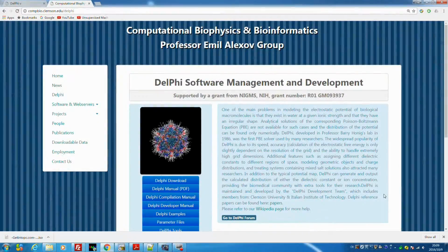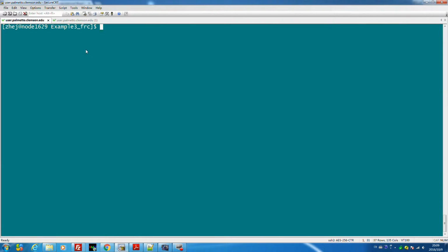Hello, this video will show you how to run Delphi example 3 and the usage of the FRC function. All the example files and software can be downloaded from the Delphi software website. It's compbio.clemson.edu/Delphi. After you download and unzip the example files, you will find example 3 FRC.